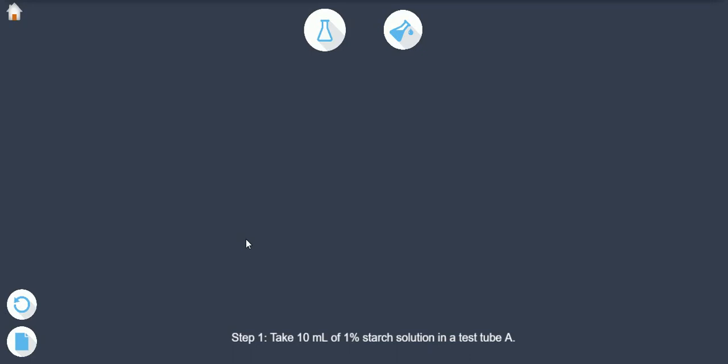Step 1: Take 10 ml of 1% starch solution in a test tube A.